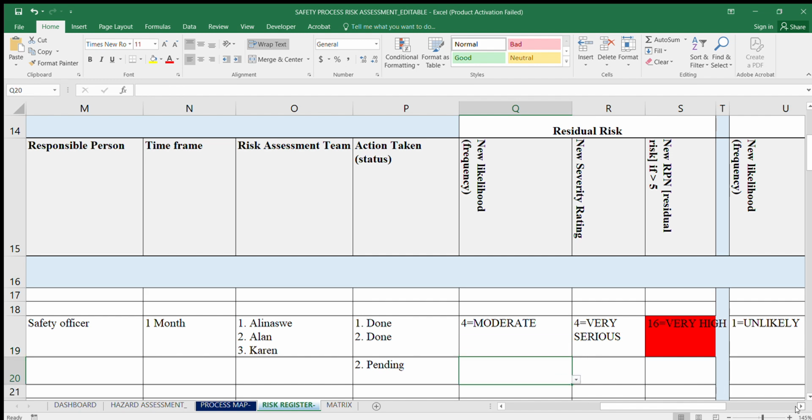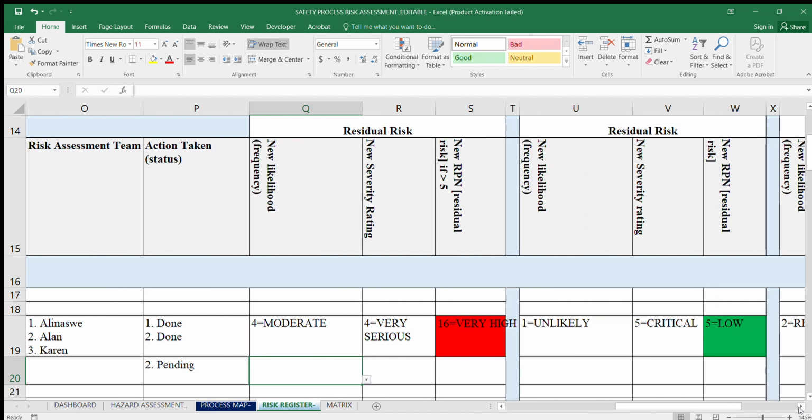This is where you do your next review. Let's say it's been 3 months after you did your initial review. So maybe this is your second review, and in your initial review, you found that there were incidences of that particular scenario. So in the initial assessment, your risk was moderate. But then in your review, you find that the risk has increased because there have been incidences of that particular scenario. So now your risk increased.